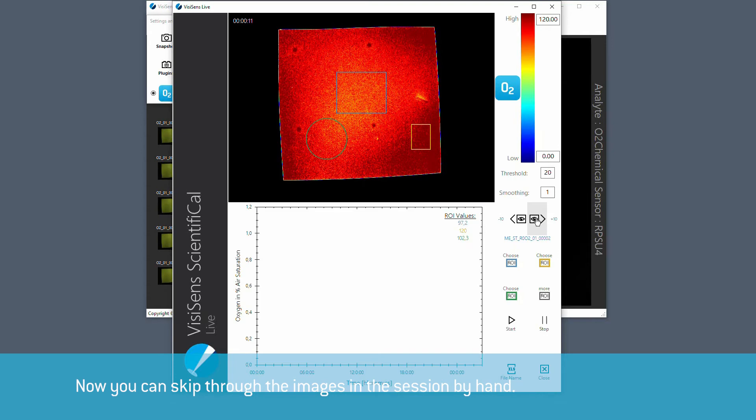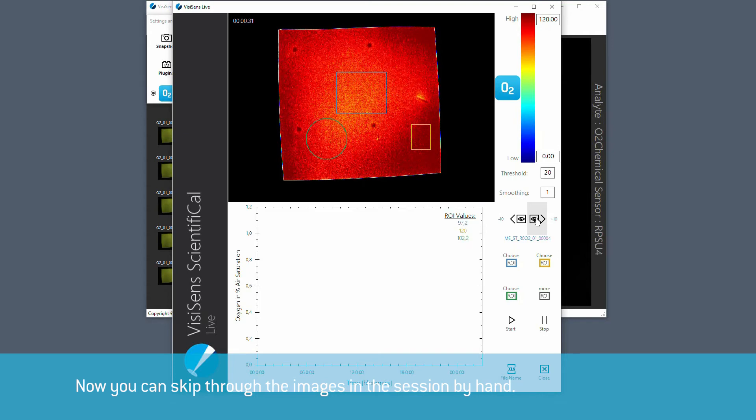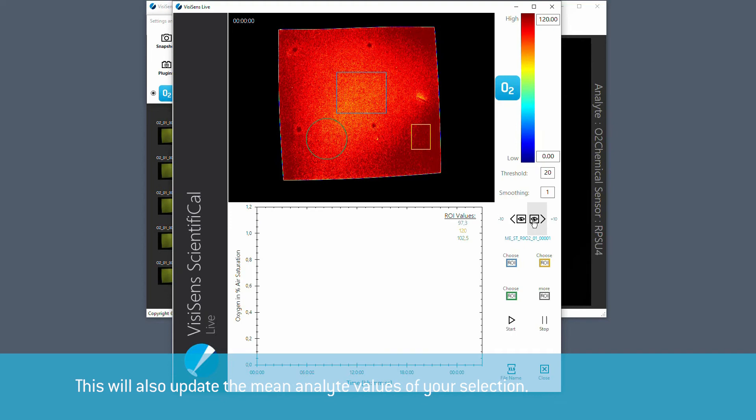Now you can skip through the images in the session by hand. This will also update the mean analyte values of your selection.